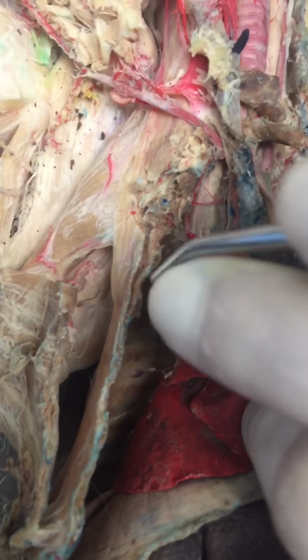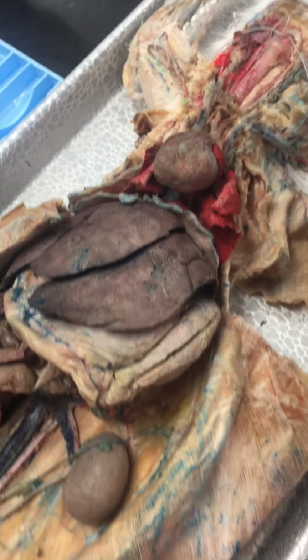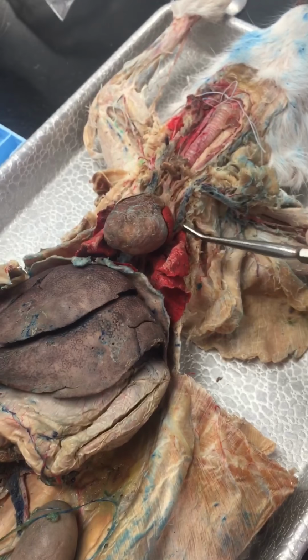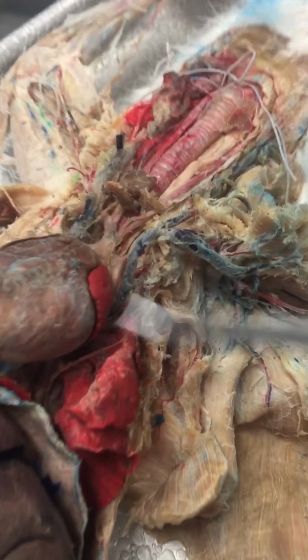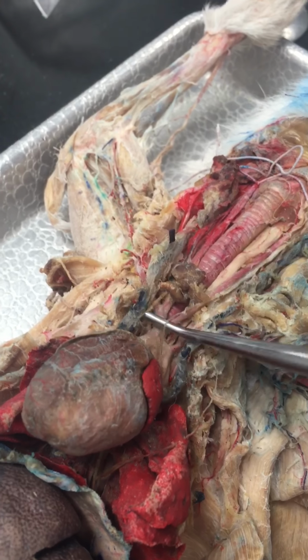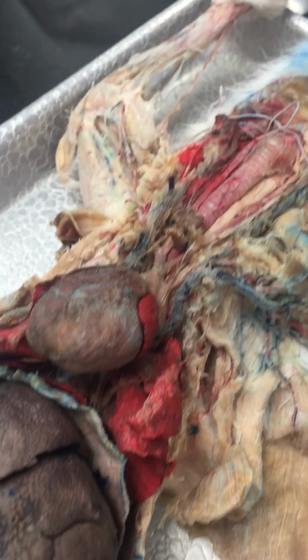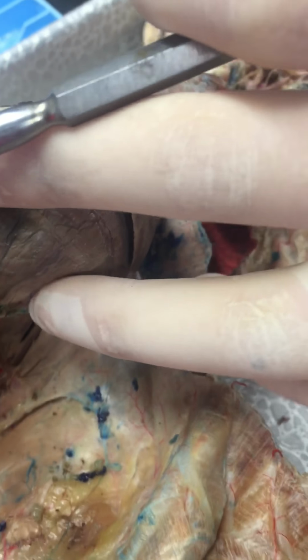Let's see what else. We have our azygous vein back here. It's a big blue one back here. You can see it right there. Let's see, are we missing anything else here? Oh, we have our 2 different nerves that innervate. This one's our phrenic. This one is our vagus.